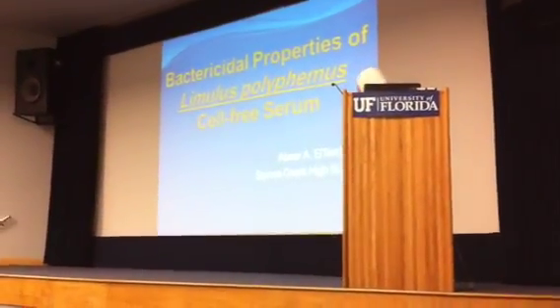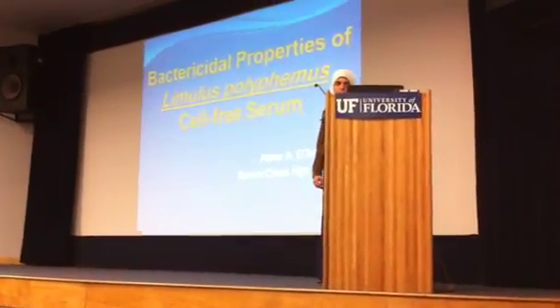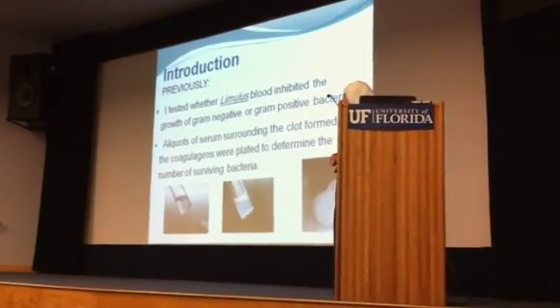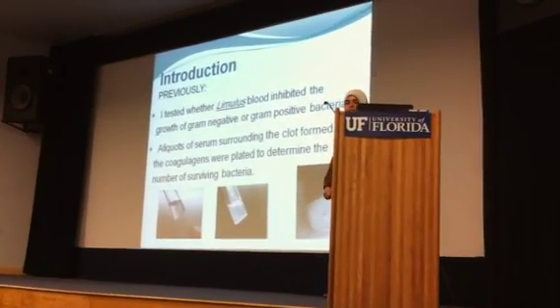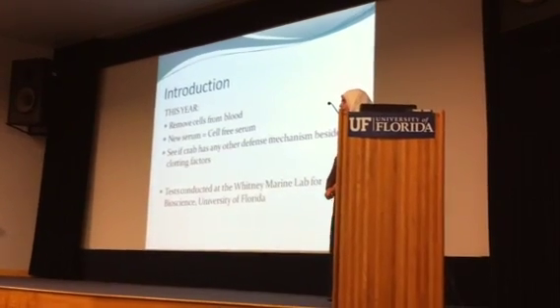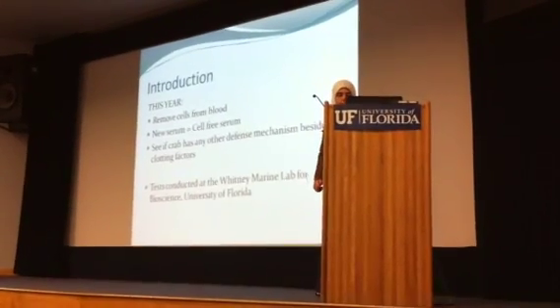I am studying the bactericidal properties of Limulus polyphemus cell-free serum, or the blood from the American horseshoe crab with the clotting cells removed. This is a continuation from last year where I used the whole blood, or the hemolymph, of the horseshoe crab in order to test for inhibition against 2 different kinds of bacteria. So this year I decided to see whether there was some other defense mechanism in the horseshoe crab besides the clotting cells that are responsible for inhibition.